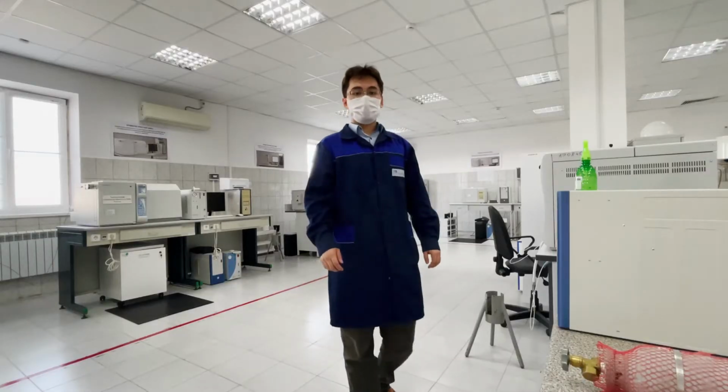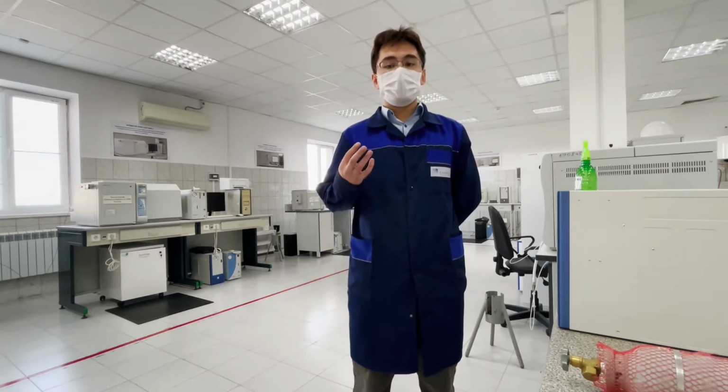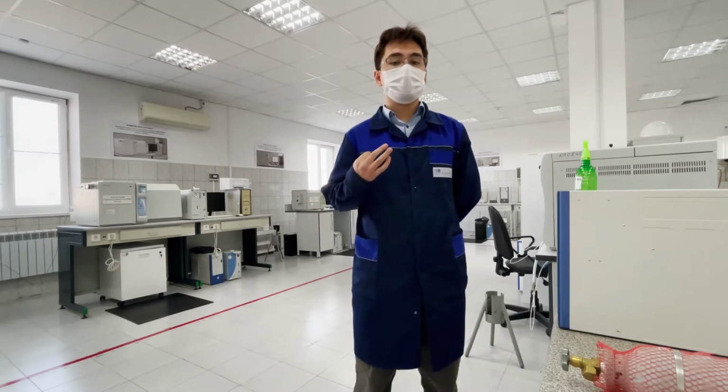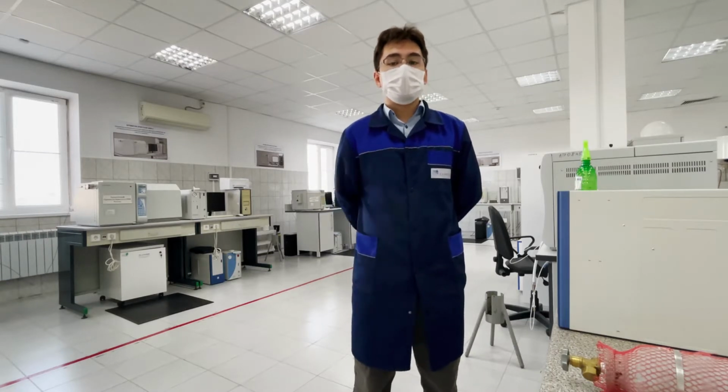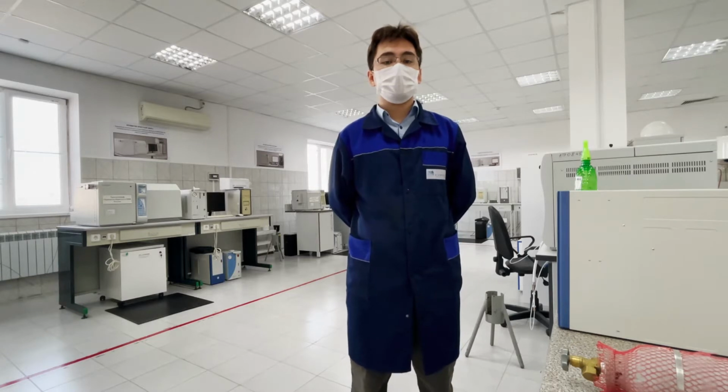Welcome to the chromatography. When examining the associated petroleum gas samples, the component composition of a gas is determined, which includes the following components: methane, ethane, propane, butanes and isobutanes, pentane and isopentanes, hexanes, heptanes, octanes, carbon dioxide, nitrogen, as well as the sulfur-containing compounds such as hydrogen sulfide, methyl and ethyl mercaptans.